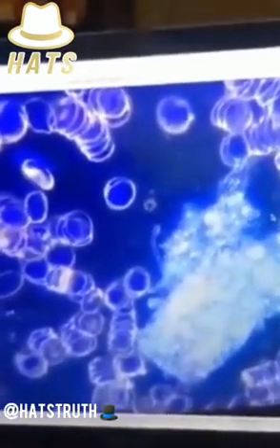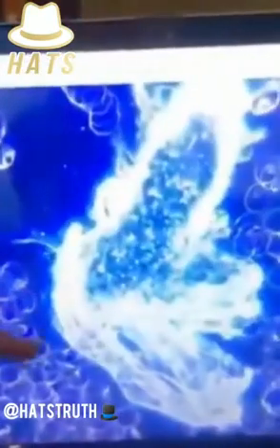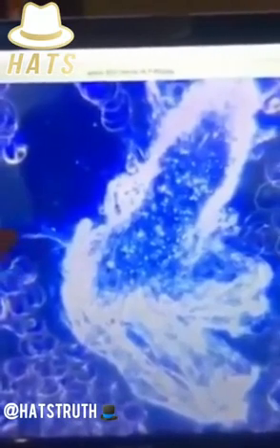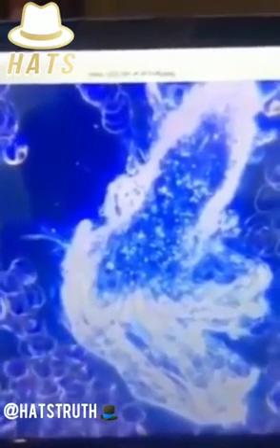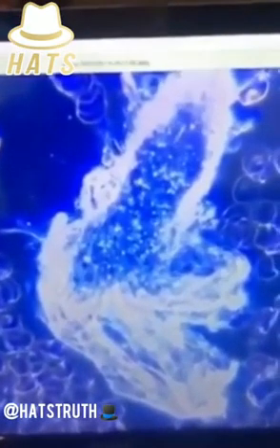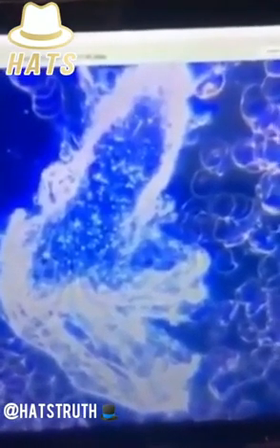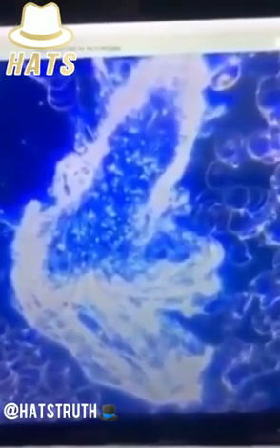So let's look at the next one and try to get through this. What are we looking at here? Here again, the blood cells are coagulated, and also again there is something in the blood. It has again these things here on the side. So very similar. I can only think that must be graphene oxide. Must be graphene. Well, Dr. Young has unequivocally proved that it was graphene. It is graphene in the blood. But we've only got microscopy to work with right now.